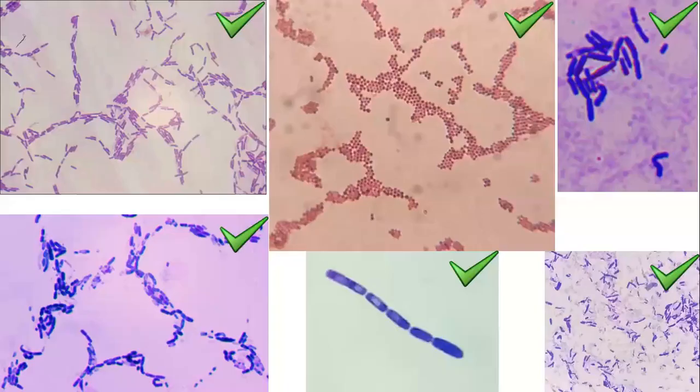All right. What not to do? See, nothing can be derived out of such an observation in the microscope. Even though the cells are good, you can see a slightly dull, different contrast around the cell structure. This can be reduced if you bring the condenser lens position much closer to your slide. Many people adjust both coarse and fine adjustment in the bright field microscope. What they are forgetting is to bring the condenser lens or adjust the diaphragm, that is the intensity of light. These things can be manipulated to get an ideal structure.